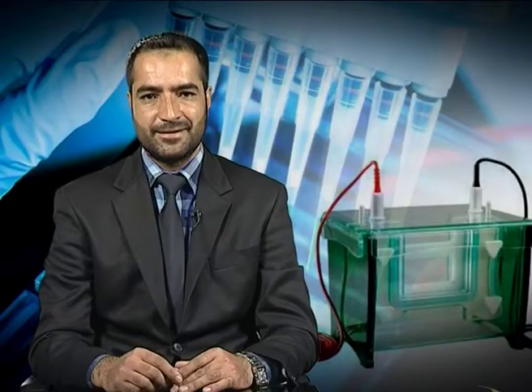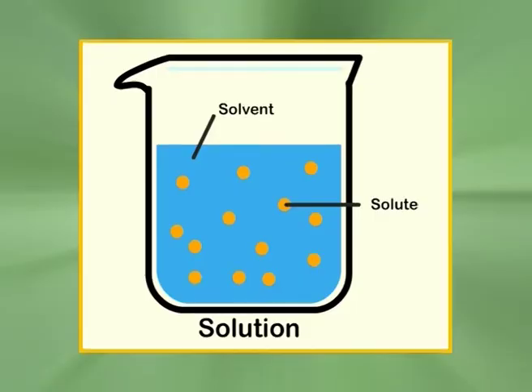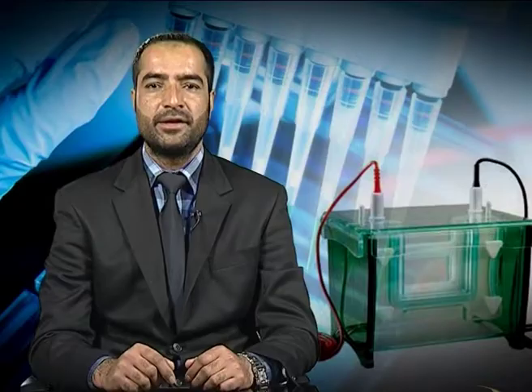Two different methods are used routinely to apply samples to the electrophoretic paper. In the dry application procedure, a sample of solutes dissolved in distilled water or a volatile buffer is applied as a small spot or a thin strip on a line drawn with a pencil, called the origin line, on the paper. Appropriate standards of known compounds are applied at other locations on the origin line.